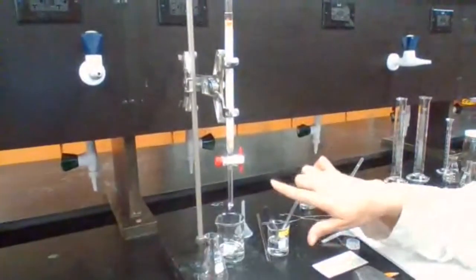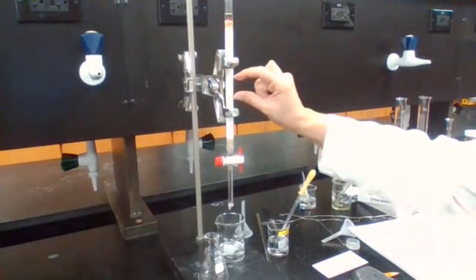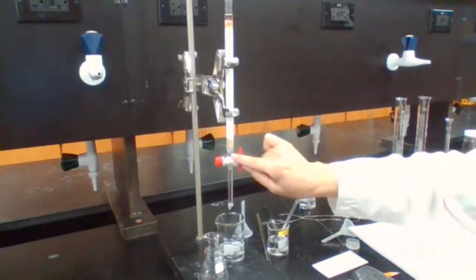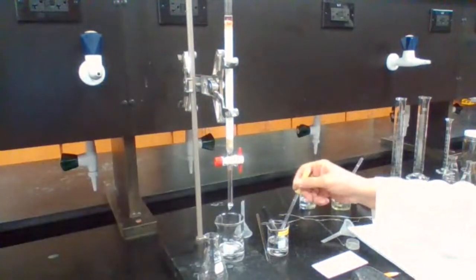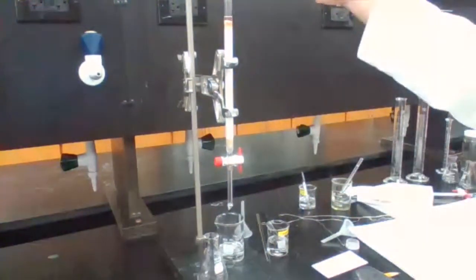You see the collections, right? The yellow band is still here, and I'm waiting for it to reach down here. I keep adding more acetone.